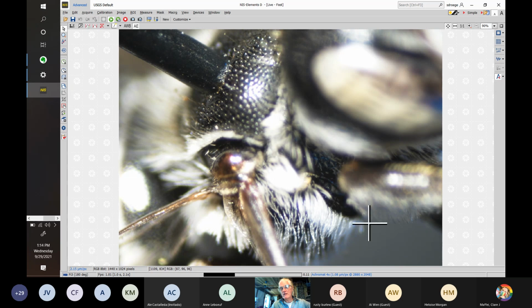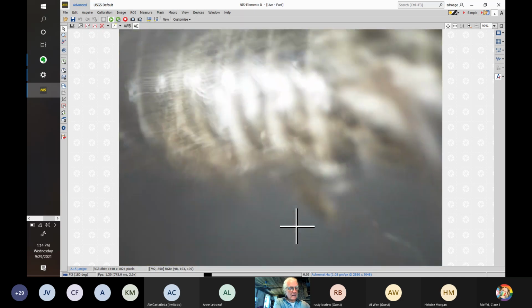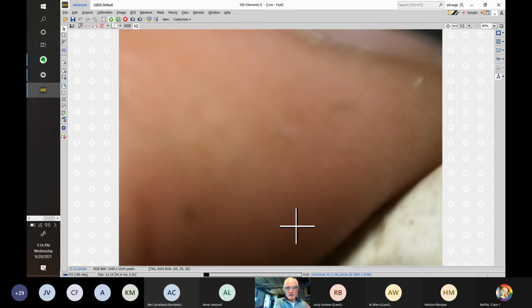And so this bare area is partially a slot for the legs if they have to crawl into a hole or otherwise become transformed to a small tubular thing. So that's part of it. We'll revisit that in another specimen. Let's look at the propodium area, although this particular specimen, I think it is cocked up a lot.